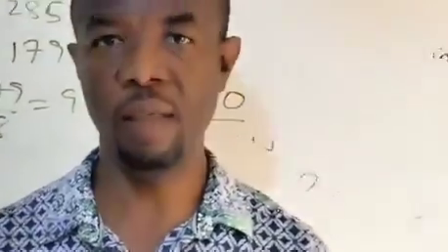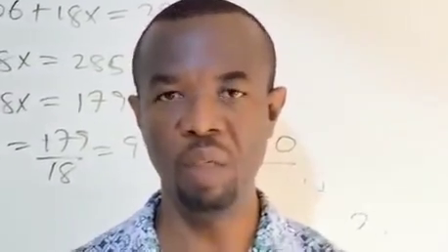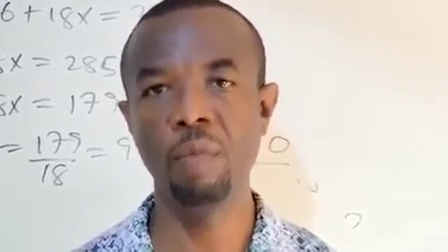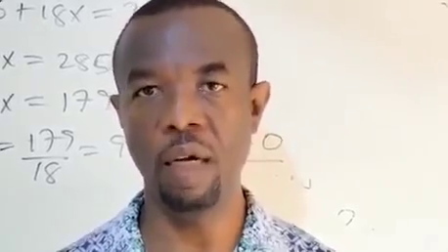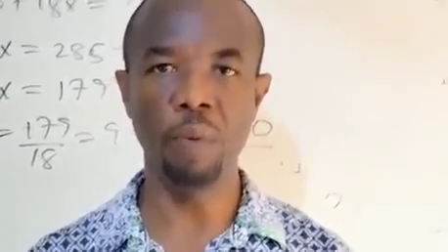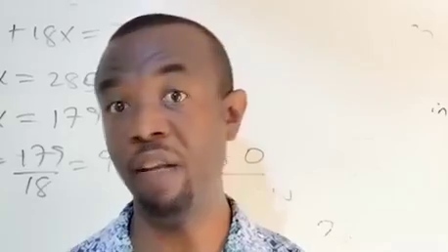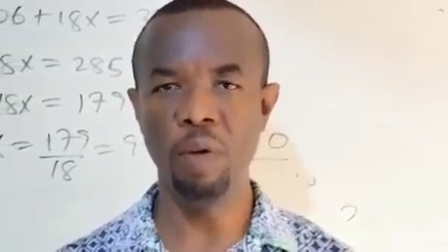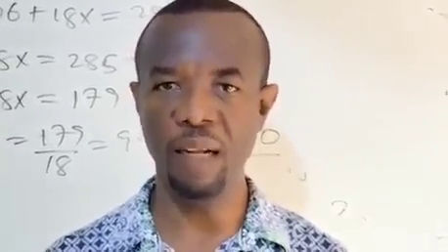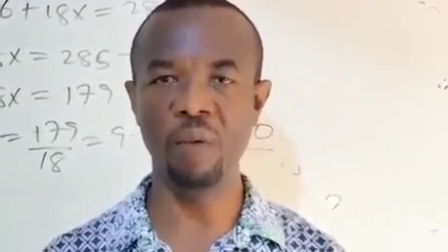So we have come to the end of this exercise, which is focused on determination of the endpoint for Alternative B, Practical Chemistry, 2024 WAEC examination. And then we have done some exercises to show how WAEC can frame questions. Don't be surprised if you enter the exam hall and you have the chemicals in a different form. Because they can twist questions, but the calculation remains the same pattern. So copy down the calculations, don't memorize them, but know how they are done. Learn and study very well.